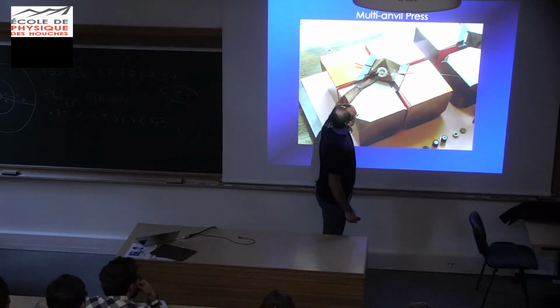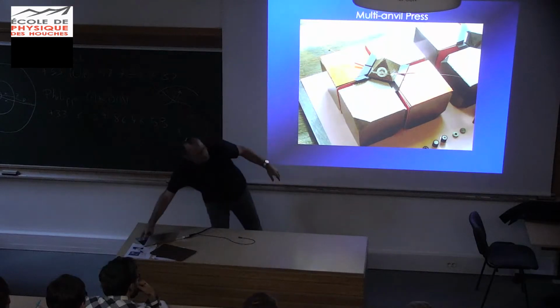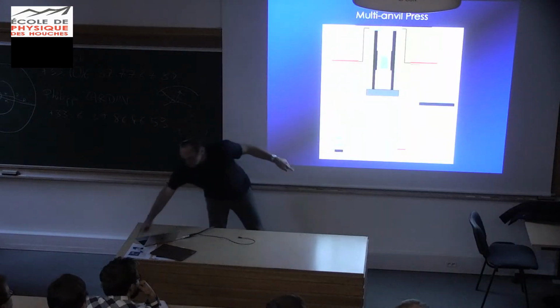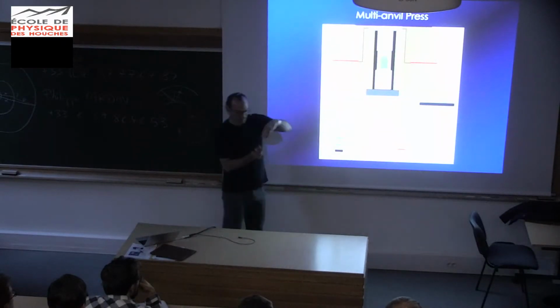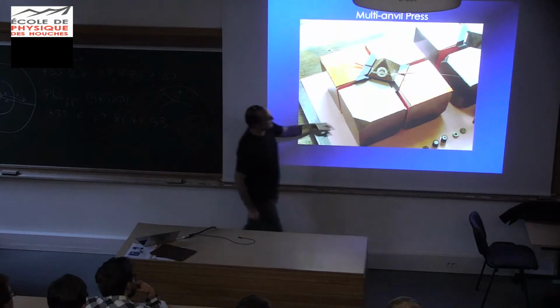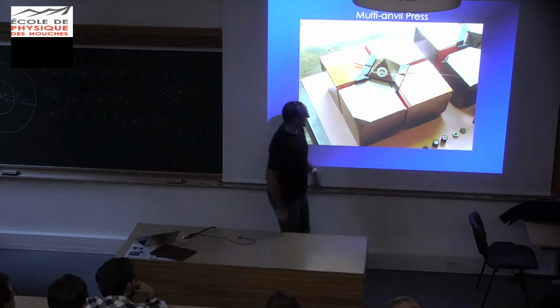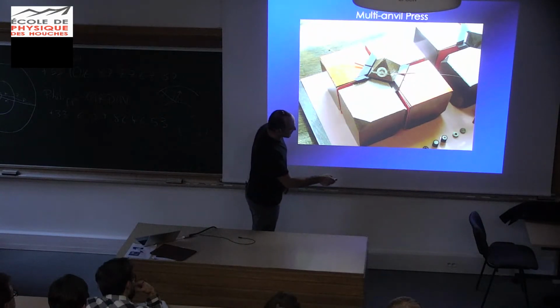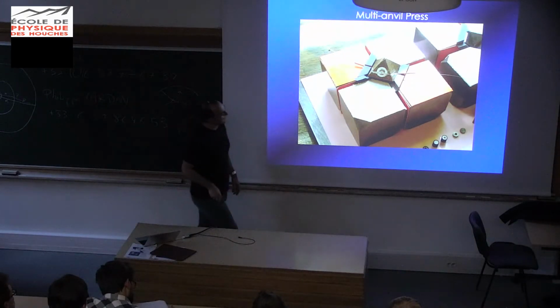So that's your octahedron, and this is the sample assembly, which is that cylinder, and it's sharing one side of the octahedron and the other one. So it's not in the axis, it's sitting like this to maximize the length within the octahedron. So it's centered on this face and goes out the opposite face. And here you have the little bits and pieces that this is made of. And this little wire is the thermocouple, okay?